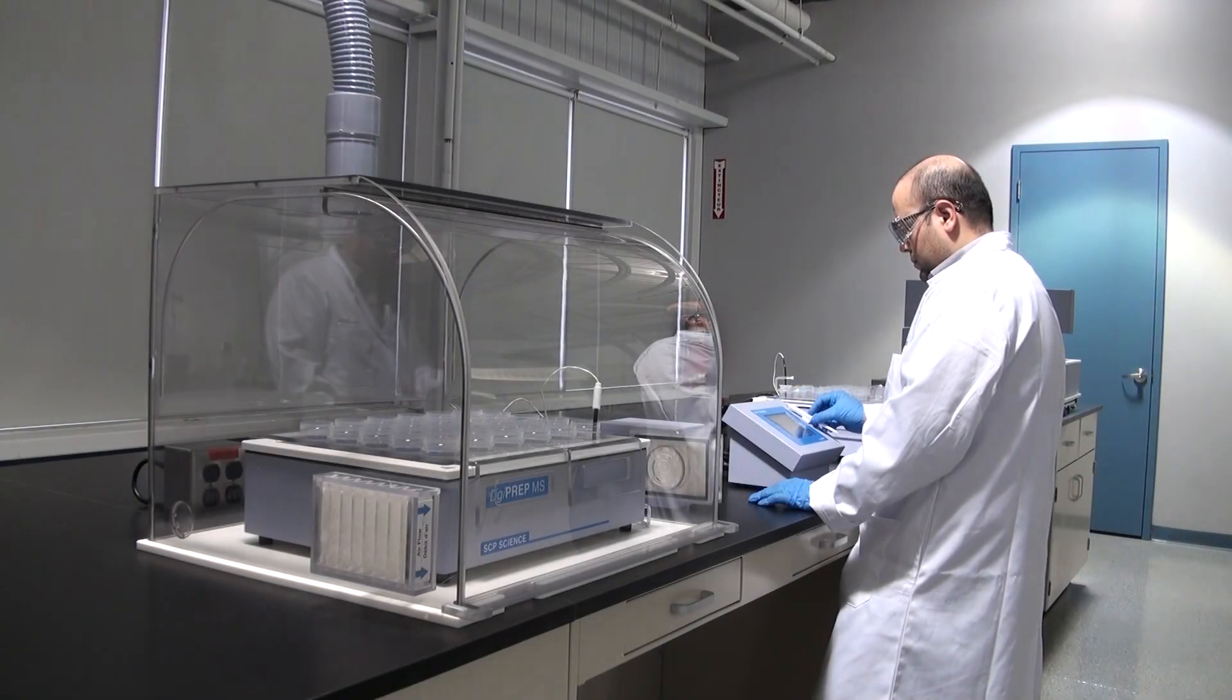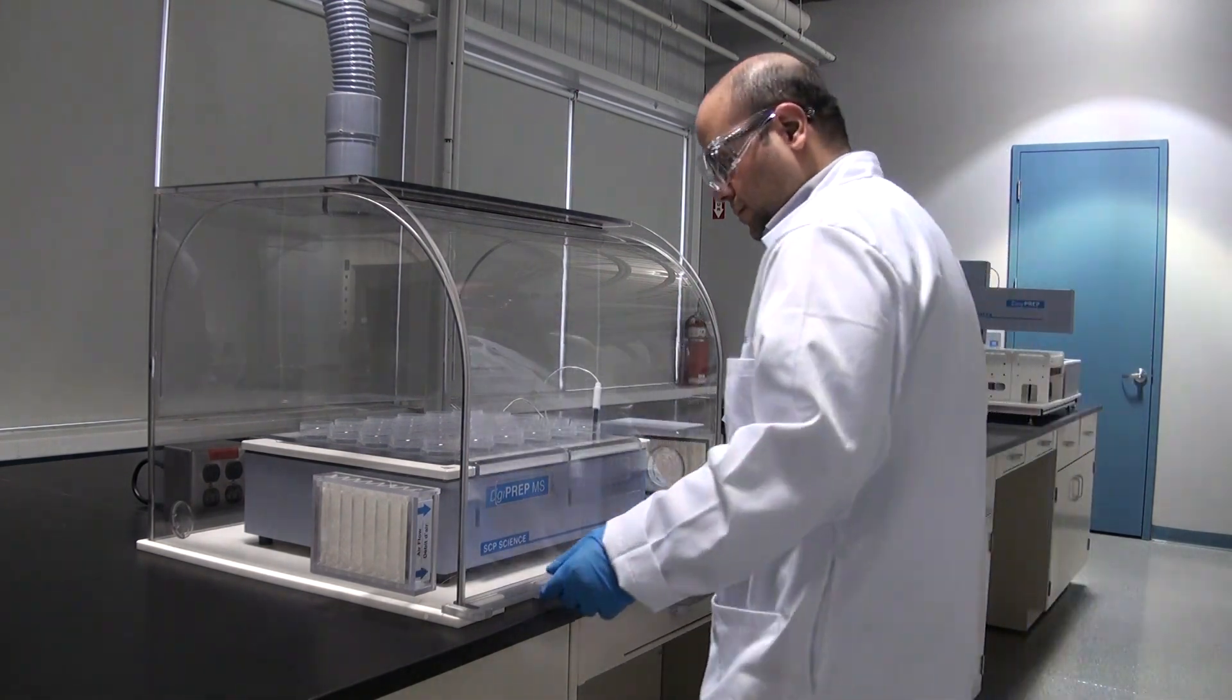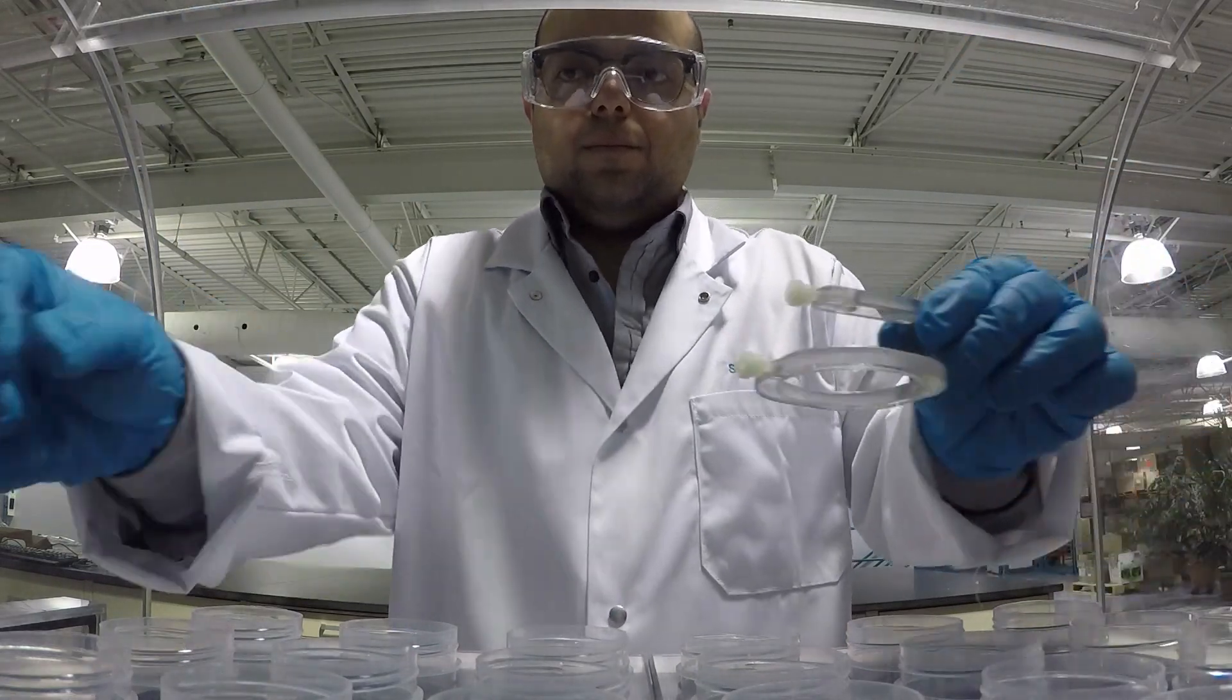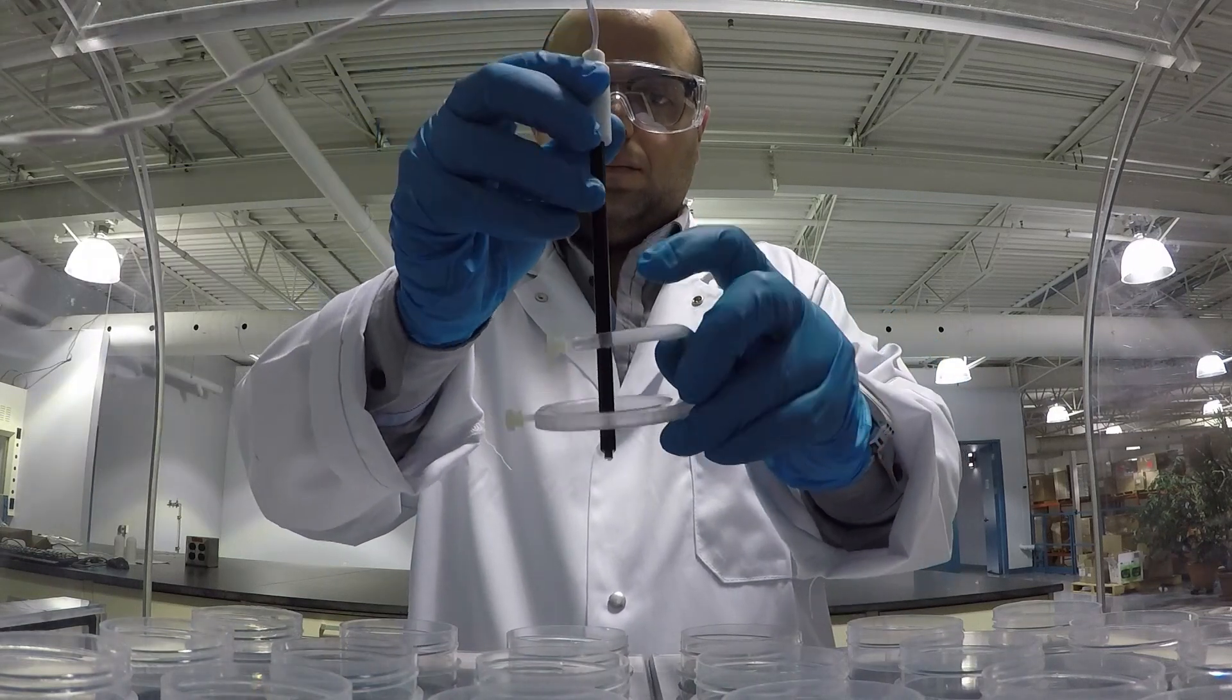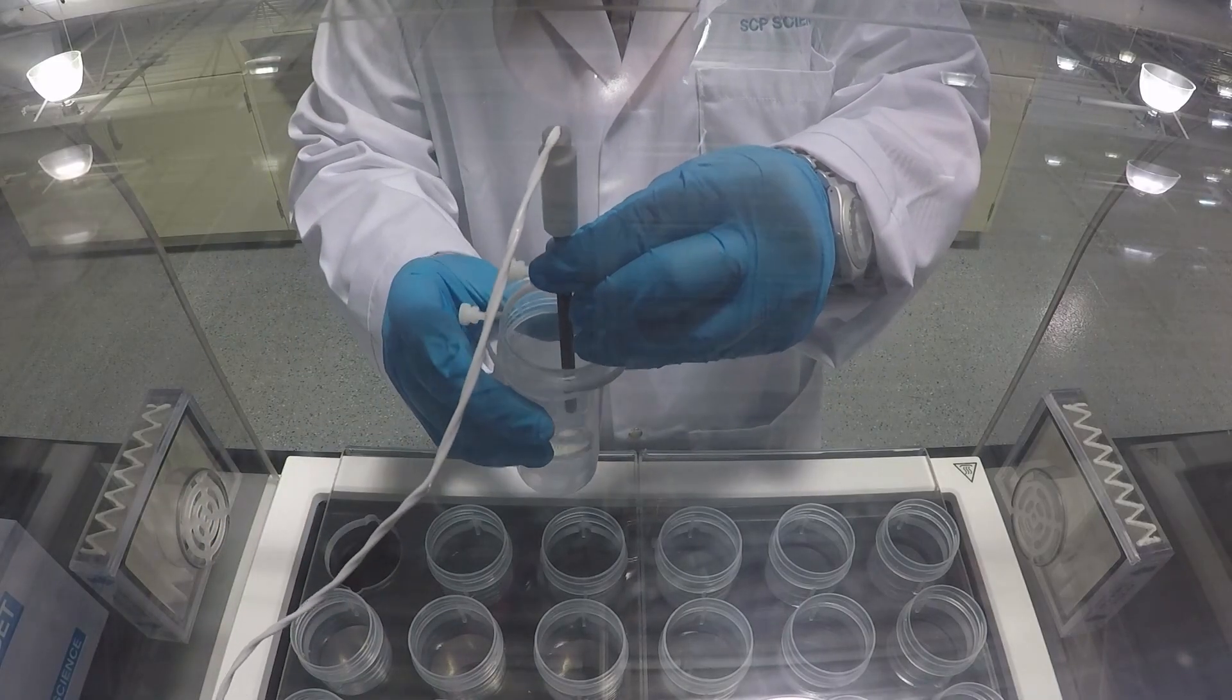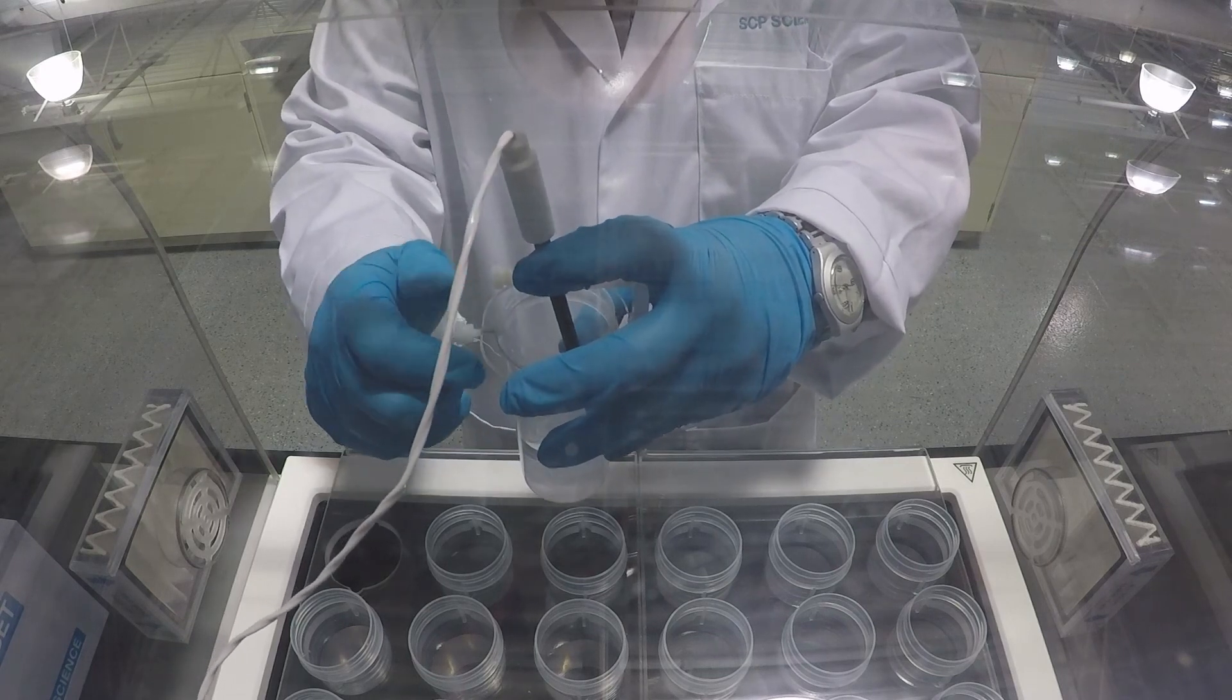The Fume hood is a bench top hood designed for use with Digiprep systems. The Lexan door opens effortlessly for easy access to samples. Universal ports offer a means to insert power cords as well as Digiprobe or Digiset probes without compromising air quality. The Fume hood is shipped flat and can be assembled in less than 2 minutes without any tools.